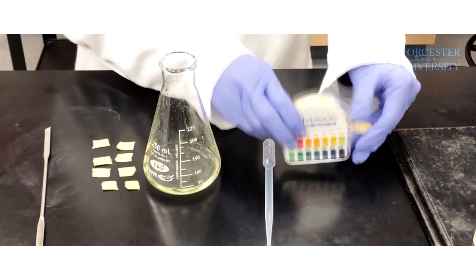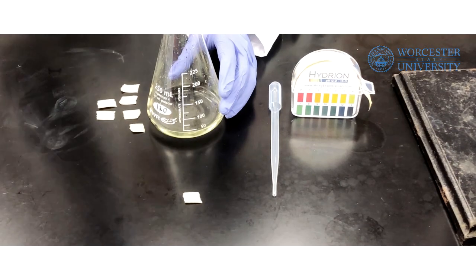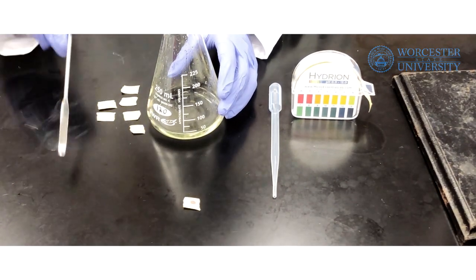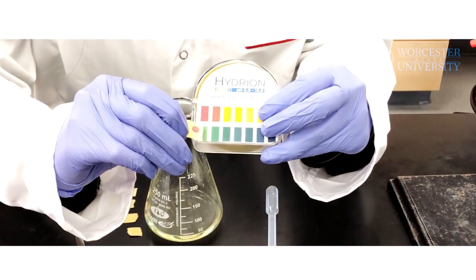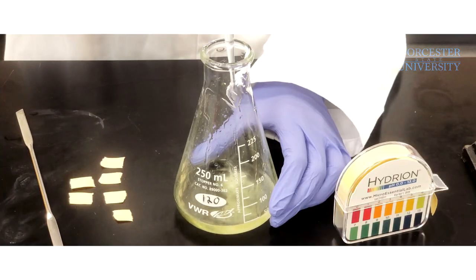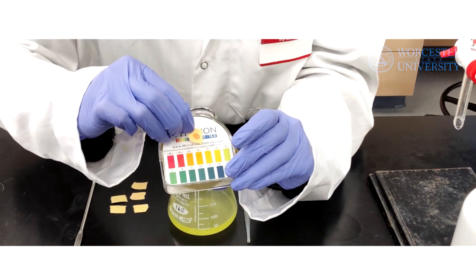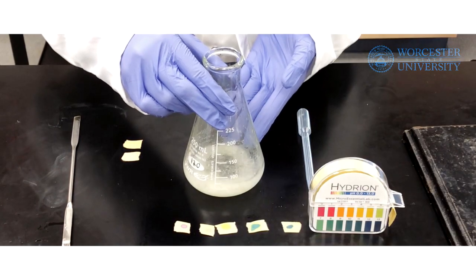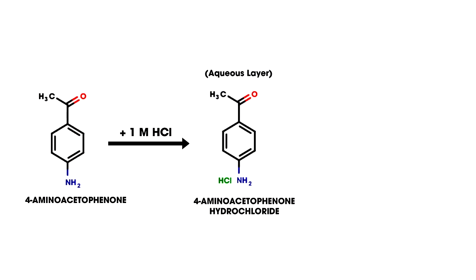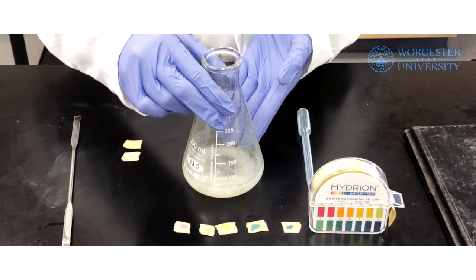Using a small piece of pH paper, determine the pH of the combined aqueous extracts. Add 3 molar sodium hydroxide to the solution until it is just basic, as indicated by the pH paper. Once basic, add an additional 5 milliliters of 3 molar sodium hydroxide. This will allow the 4-aminoacetophenone hydrochloride to return to its original form, 4-aminoacetophenone, which you will see as precipitate.